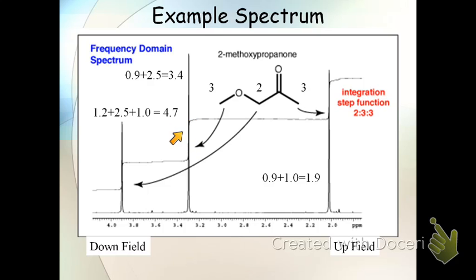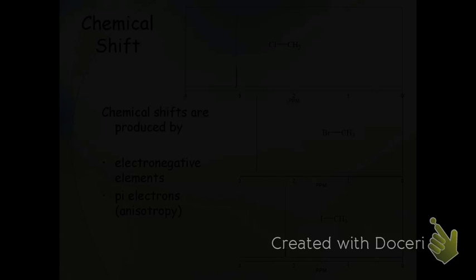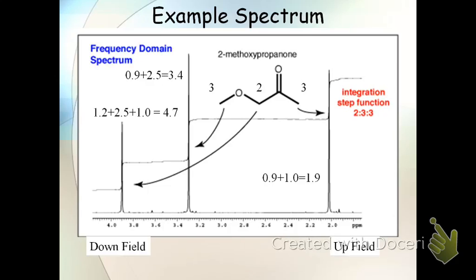This represents, oops, I touched the slide with my hand, sorry. This represents the relative area of this peak, and then this represents the relative area of this peak.